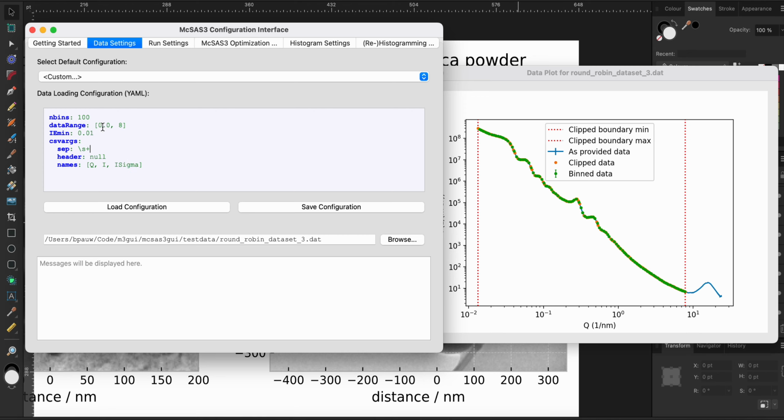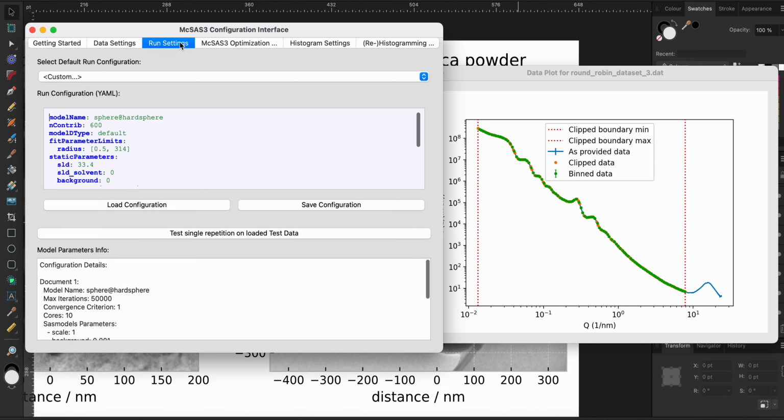We're clipping the data range, and we haven't cheated with our minimum uncertainty estimate. This is now 1%. So the read-in is not very hard. I can spend a couple more words on that, but I don't think it's absolutely necessary.